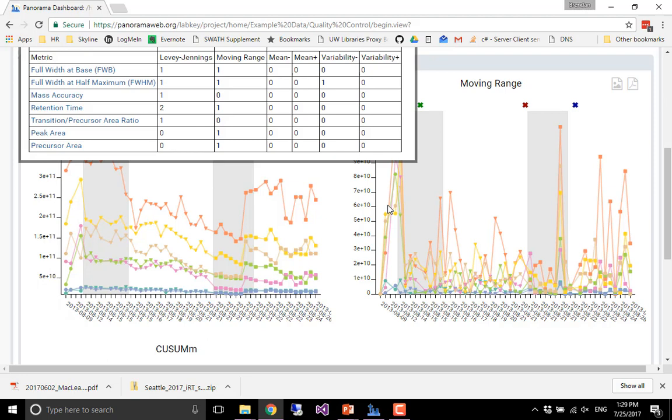So just a variety of different, basically statistical process controls looking at those different types of outliers. And we have some capabilities to show a summary. So have separate QC folders, basically one per instrument in the lab or one per project, and then a dashboard view to look across all of those to see what's the status of each one. Is instrument A having a lot of outliers while the others are okay? Okay, let's focus on that one and get it back under control.